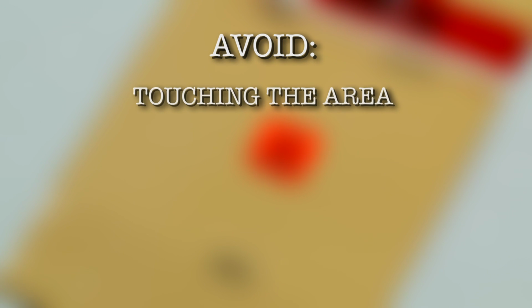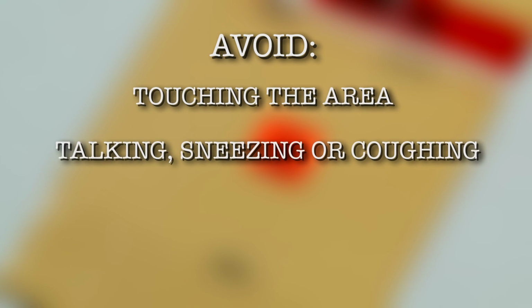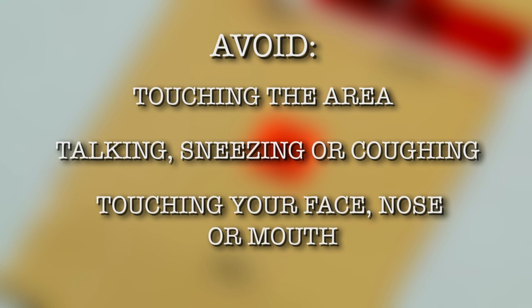Avoid touching the area where you know or think DNA may exist. Avoid talking, sneezing, or coughing over DNA evidence. Avoid touching your face, nose, or mouth when collecting and packaging DNA evidence.